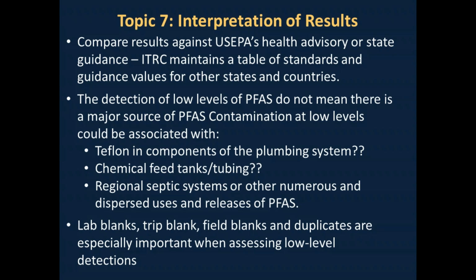It's important, though, that you have an appropriate number of lab blanks, trip blanks, field blanks, and duplicates to make sure you know what you're dealing with when you have low-level detections, if it's real or if it's some other source that's not actually in the drinking water.